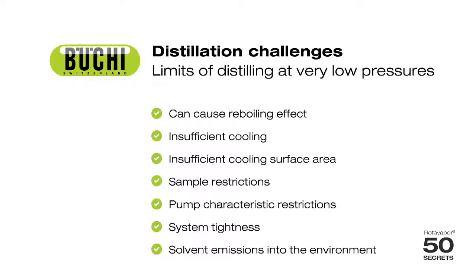It's important to mention that some other effects play an important role too. So we can't just have a low vacuum. Things like reboiling, cooling, and the sample, of course, play a big impact on the choice of the vacuum. So now you understand that separations are not always easy. There are even some physical limits. If you need to know more, please contact your specialist.